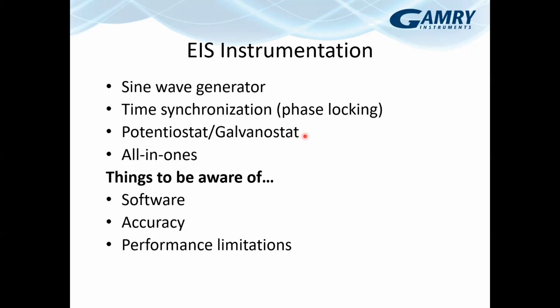Electrochemistry is more involved. We use a 3-electrode cell for most electrochemical experiments, and so these traditional, electronics type impedance analyzers are not going to get there. We also have feedback control. So when we apply a signal, we don't just assume that that gets there, because there's ways that that signal can get interrupted. There's bandwidth issues. So we actually measure the signal, even the signal that we're applying, as well as the response, to make sure that if we're asking for 10 millivolts RMS, that we're actually getting to 10 millivolts RMS. And that requires a potentiostat.